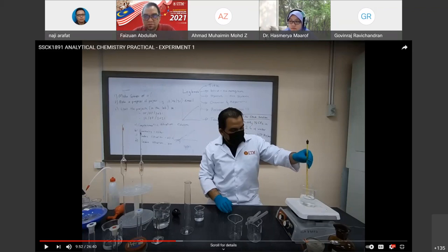Nurul Hajaratul Aswad. Oh, a very good name. Yes, doctor. I use a towel as a precaution step. Use a towel to do what? To remove the beaker, I think. Okay, to hold the beaker if it is hot. Good. And also we have gloves. If you have gloves in the lab, you use gloves. Yes, towel, a good answer from Hajaratul Aswad.